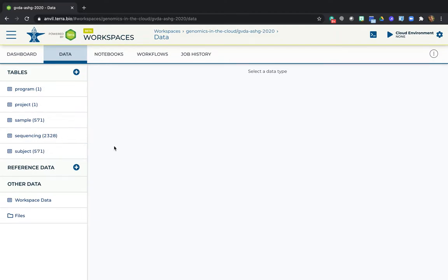In the first tutorial, you looked at the participants' phenotypic data in the subject table. So this time, let's have a look at the genomic data, which is stored in a table called sequencing.